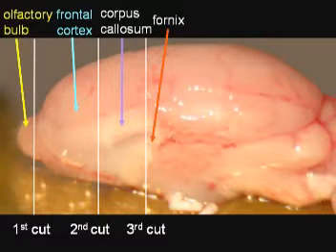On the fresh brain hemisphere, it's very important to recognize the corpus callosum and the fornix first. Then we can easily locate the three cuts. The first cut plane is at the connection of olfactory bulb and the frontal cortex. The second cut plane is at the genu of the corpus callosum, and the third cut plane is at the anterior tip of the fornix.